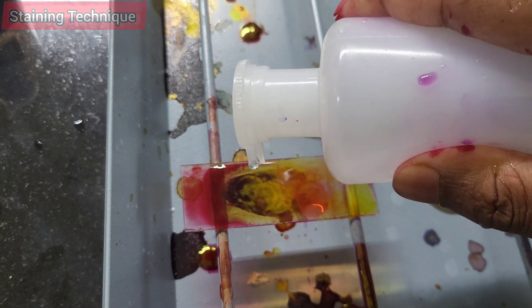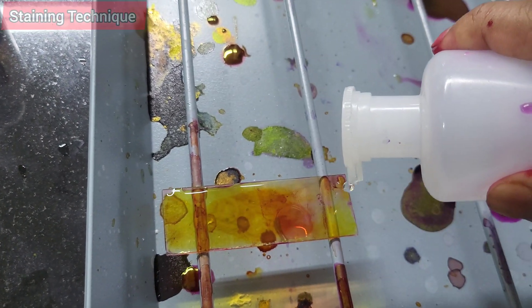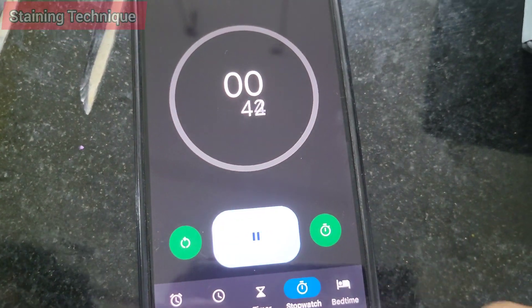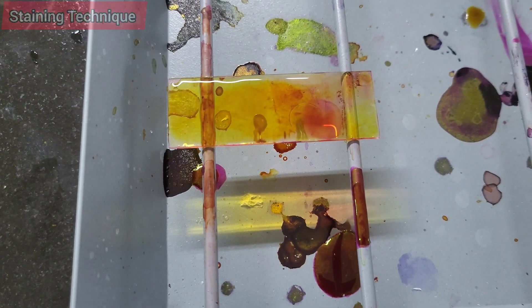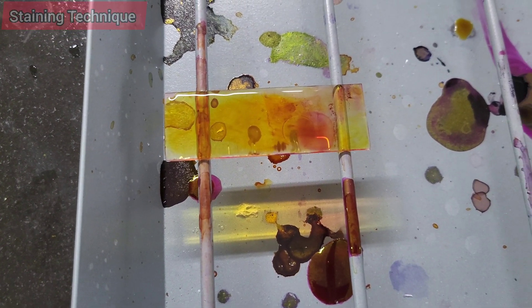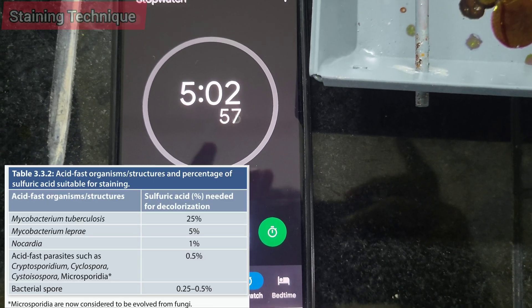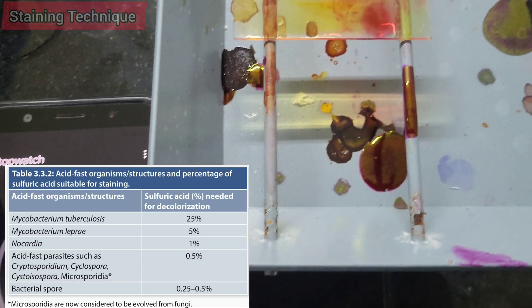If the slide is still red, reapply the sulfuric acid and wait for one to three minutes, and then gently rinse the slide with tap water. We can also use 3% HCl in ethanol as a decolorizer. The concentration of decolorizer depends upon the concentration of mycolic acid present in the cell wall. Higher the concentration, more is the acid-fastness, hence higher percentage of sulfuric acid is required for decolorization.